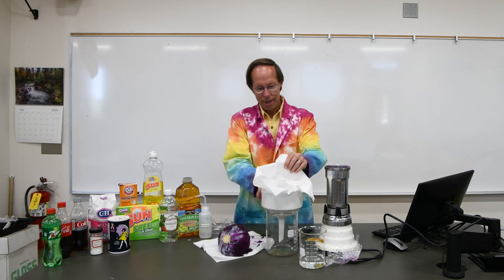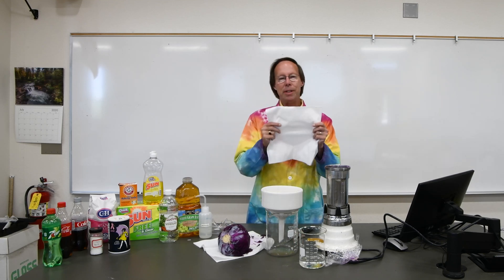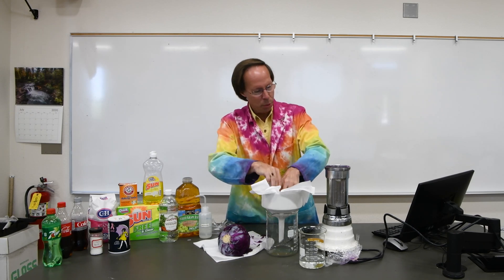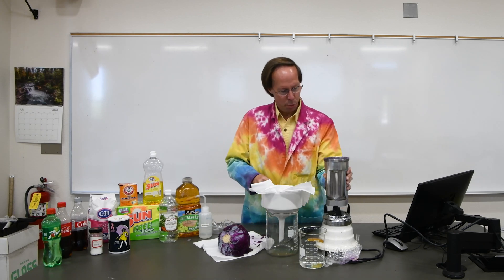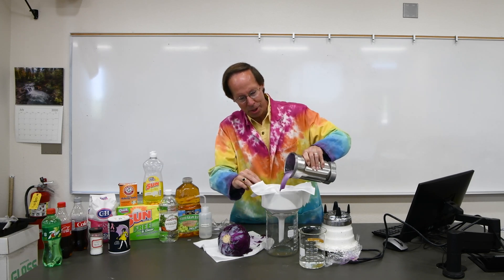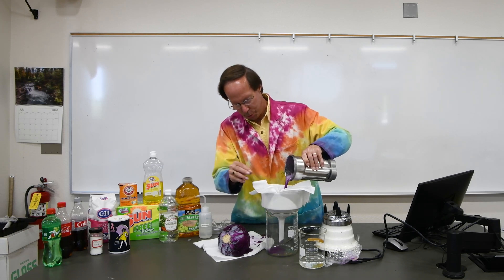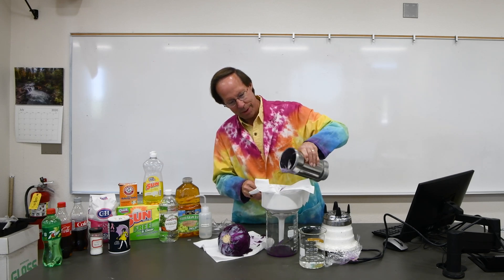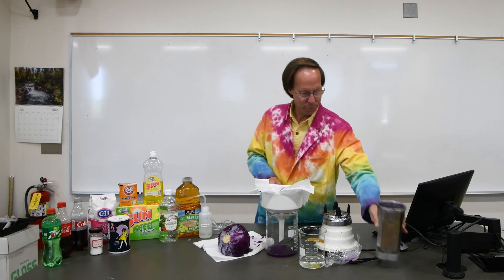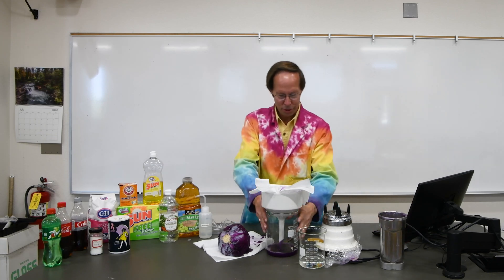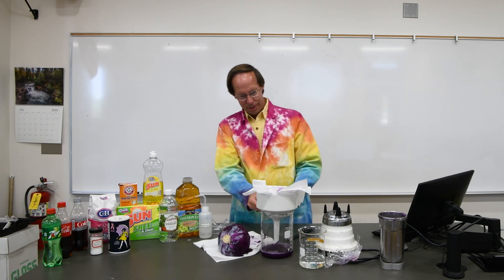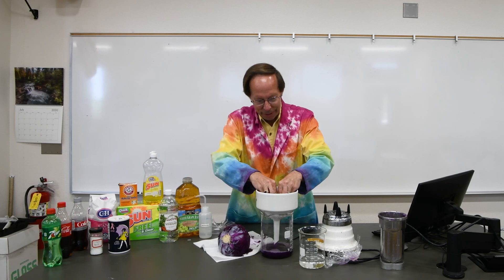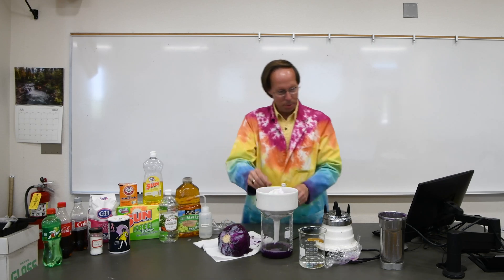Basically all you need is just a paper towel. You could do this at home with a colander and a paper towel and it would work perfectly well. So we'll go ahead and pour our cabbage sludge in here and we'll let the purple juice drain through. You can see it's a very lovely color there. We can speed it up. We'll simply take our paper towel and just sort of squeeze it a little bit. There we go. We've got quite a bit of juice there.